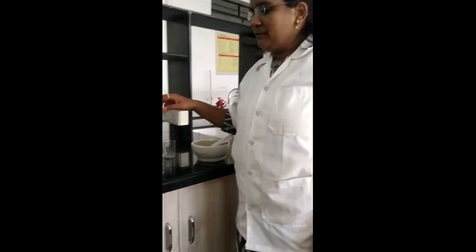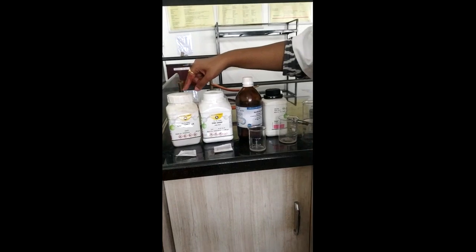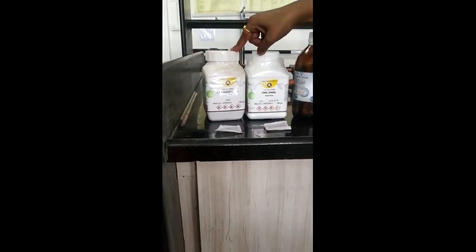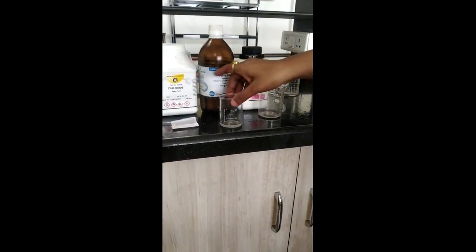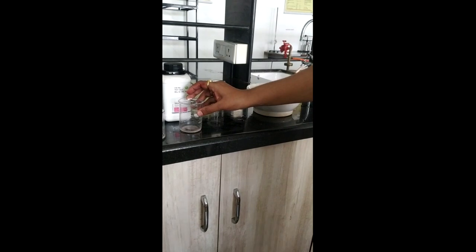So now for performing the actual experiment, we will shift to the lab. So we have calamine, which is previously weighed. This is zinc oxide, which is also previously weighed. This is the olive oil, which is taken into this beaker, and this is calcium hydroxide, from which we have already prepared the calcium hydroxide solution.